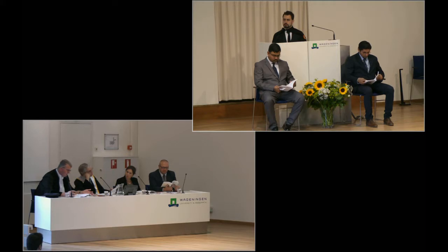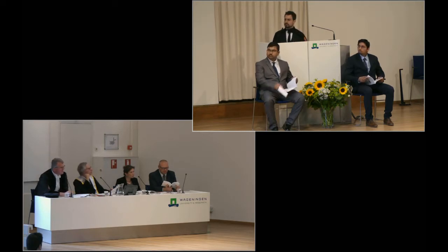Mm-hmm. But if I look at the infrared for the same sample, I have the impression that there are still two OH groups present. At least the blue one, top. You say one type of OH? I would say one type of oxygen. I have no idea about the types of OH in there. I think it's very hard to distinguish between secondary and tertiary alcohols, for instance.